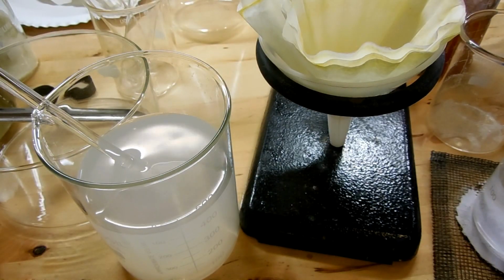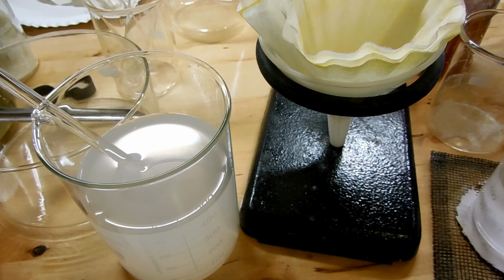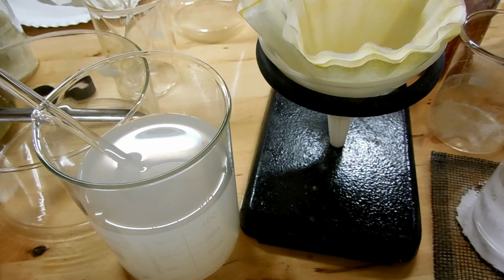So I'm going to repeat that process with all of these other possibly lead-containing things. And then once it's rendered into the carbonate, it should be safe to dispose of just as normal trash.